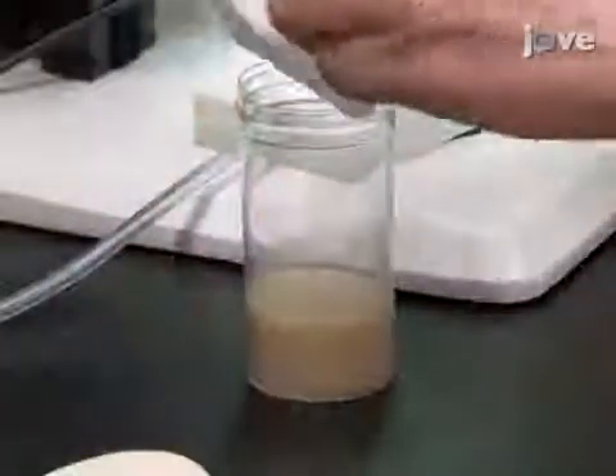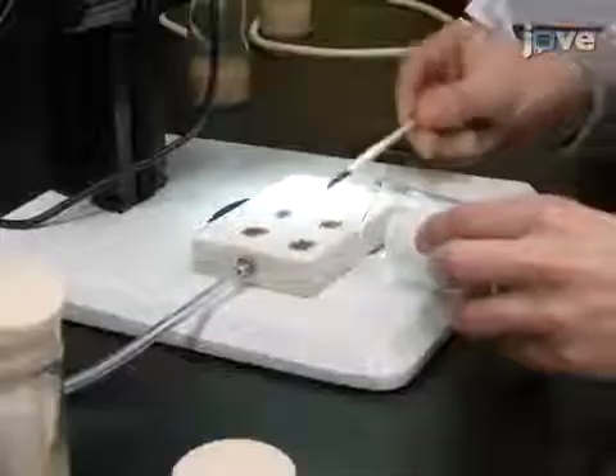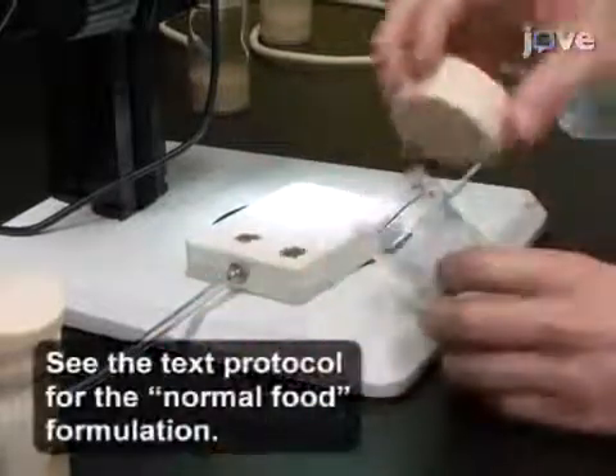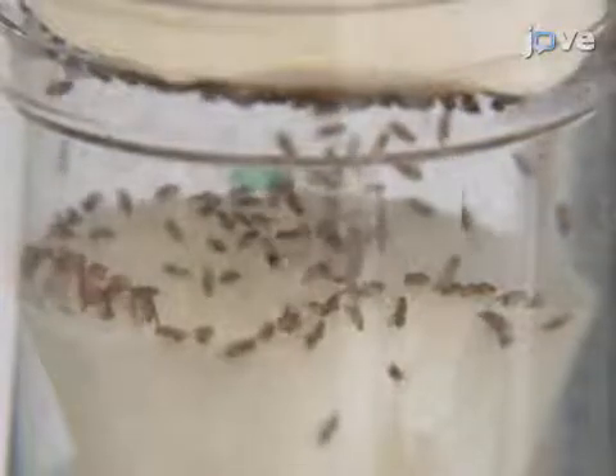Ten days in advance of collecting the male subjects, add filter paper to a fly food bottle and establish at least six normal food 175-milliliter vial cultures. Then add around 20 males and 30 to 70 virgin females to each bottle.